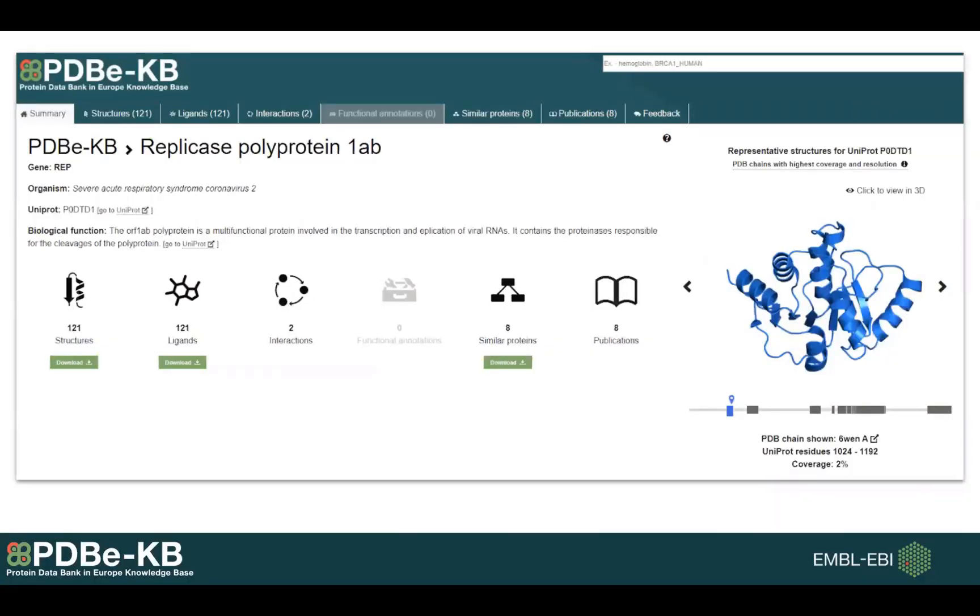This is the example of one of the coronavirus proteins. This is a polyprotein. And as you can see, there are already 121 different PDB entries for this particular protein and also 121 small molecules, as well as 8 different similar proteins.